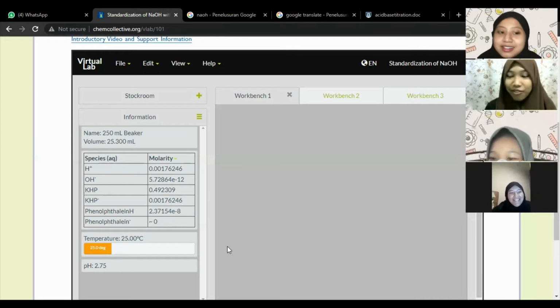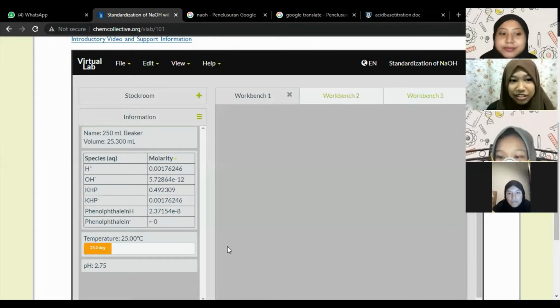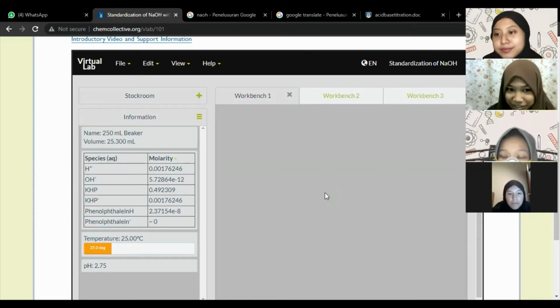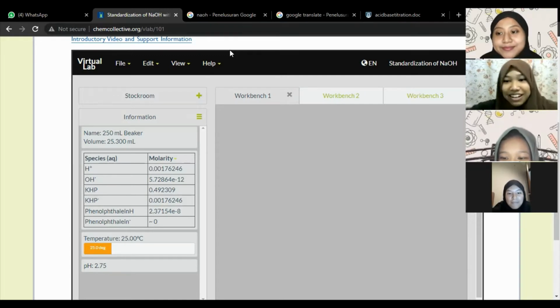Alright, and now for today's video, we want to take a deeper look at the Virtual Lab: the standardization of sodium hydroxide with KHP solution in acid-base titration. Now we're going to learn about the objective of today's video, which will be presented by Ragil.